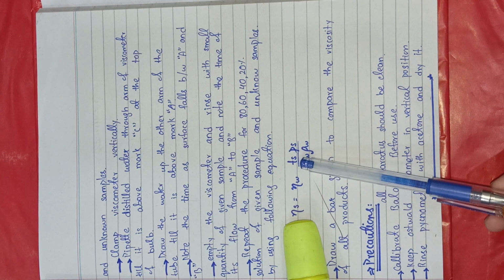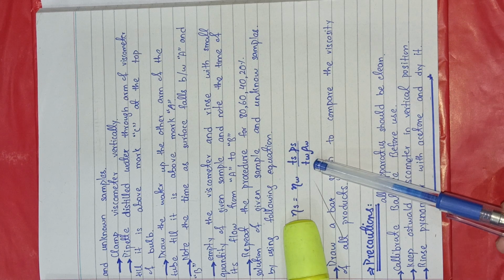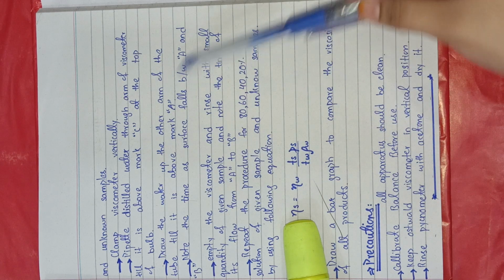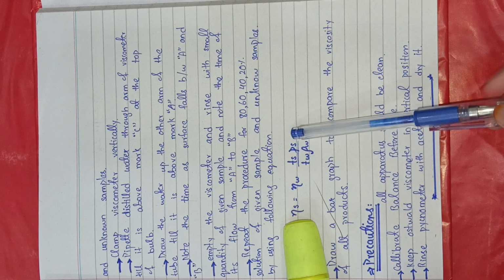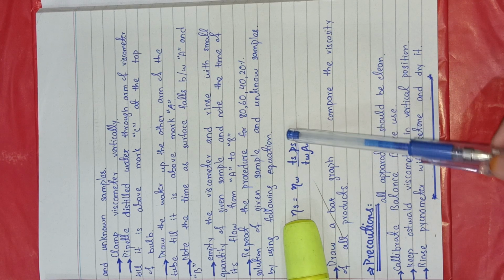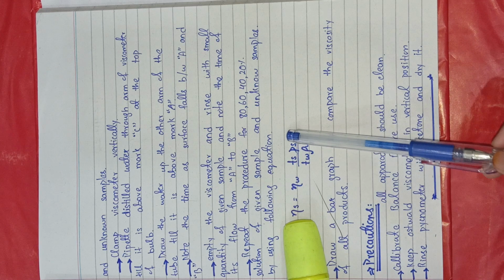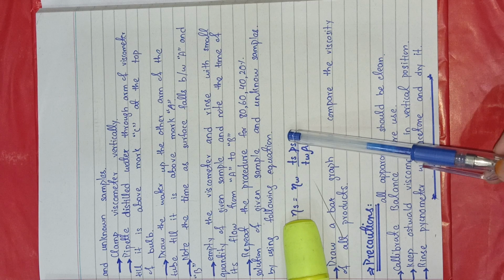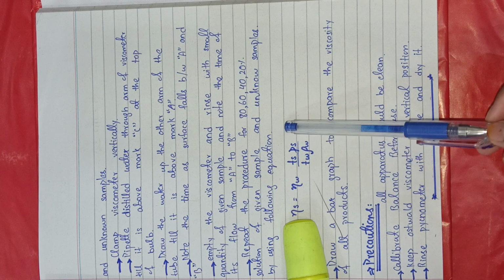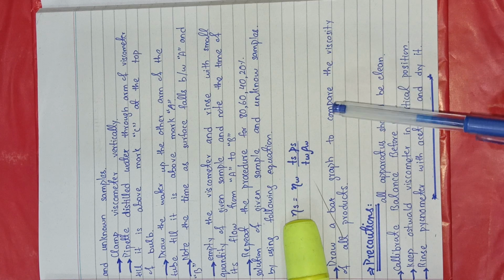Then you will take the time for the substance and the time for the water, which you will calculate by the method I explained to you. And you also need the density of that substance. To measure that density you will weigh it, then find the volume of it, then divide the weight by the volume, and then you find the density. And similarly the density of water can be calculated by it.